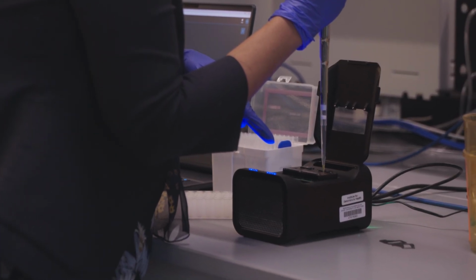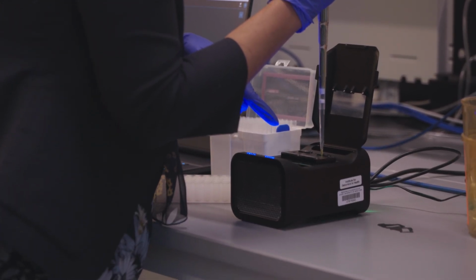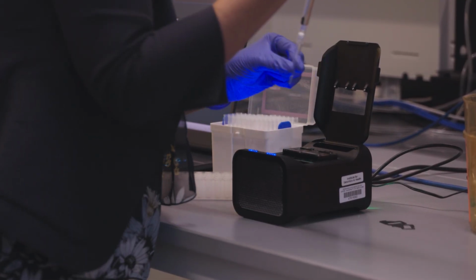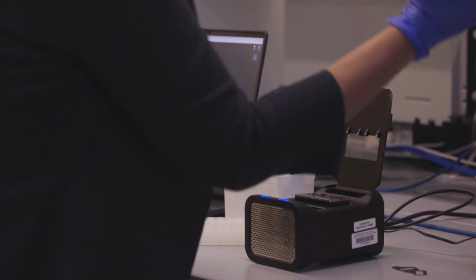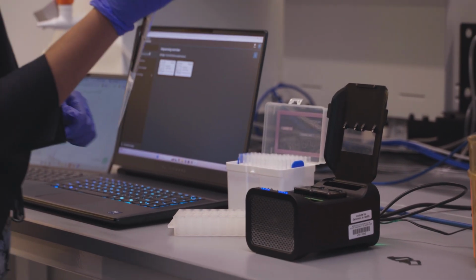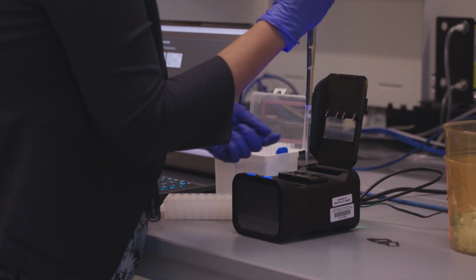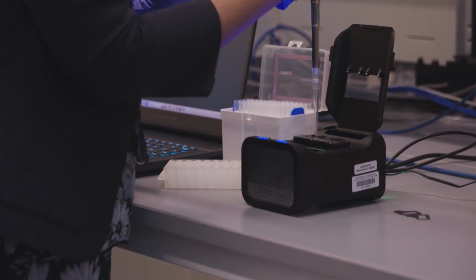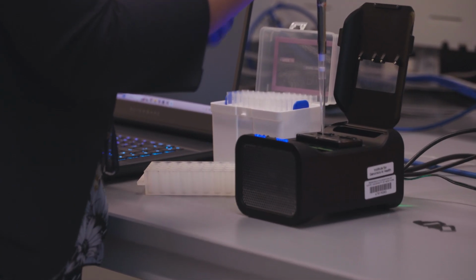So you take out 200, or you gauge it? No, we just do probably a little bit more. 30 microliters or so. I did 60. 60 microliters. There is no exact volume. You can do 20 to 30 microliters. That should be enough. The purpose is just to get rid of that air pocket here.